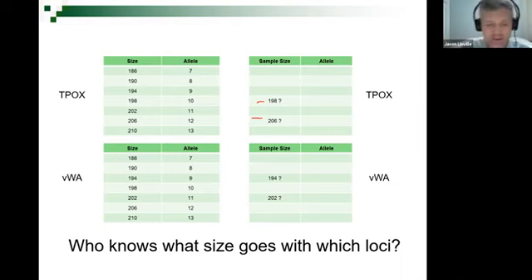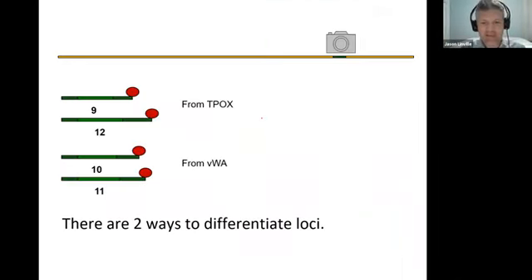All right, and I think using the different dyes is going to be the easiest one to visualize, okay? We order these primers, right? We can choose to have them labeled with whatever. It's not just like label them with a fluorescent dye.